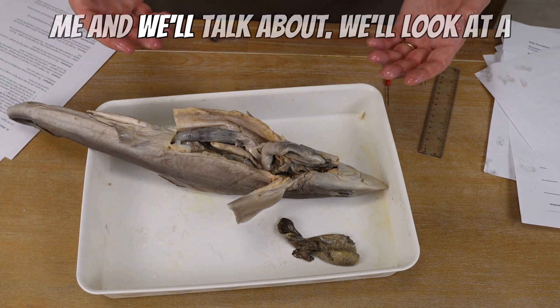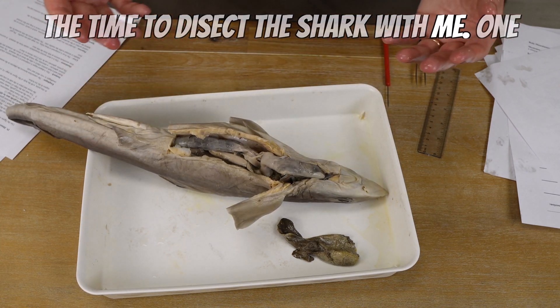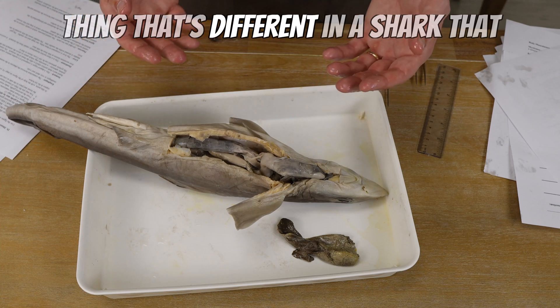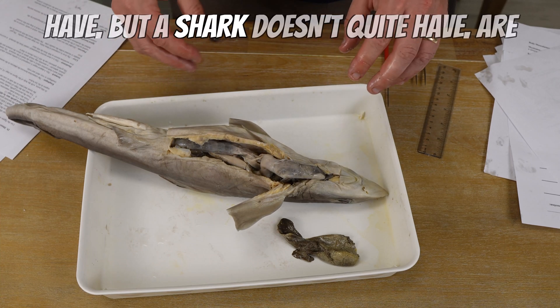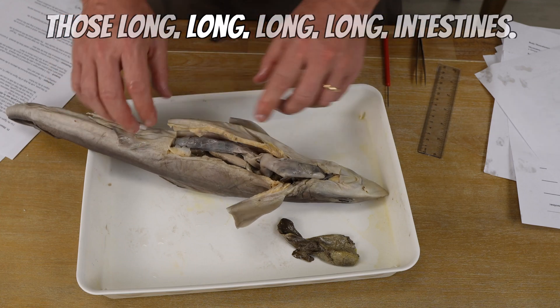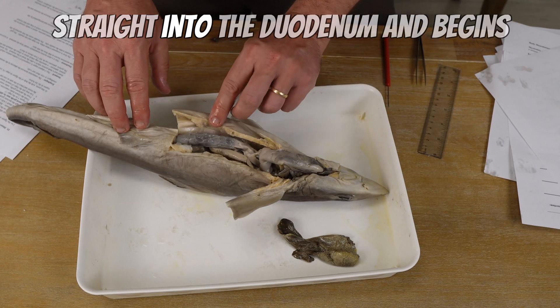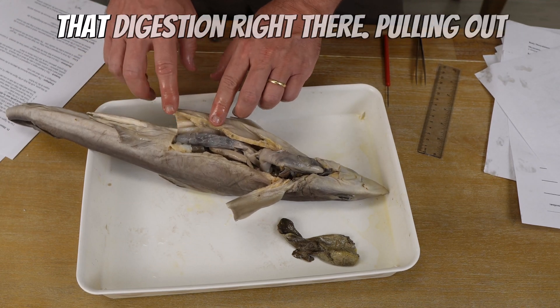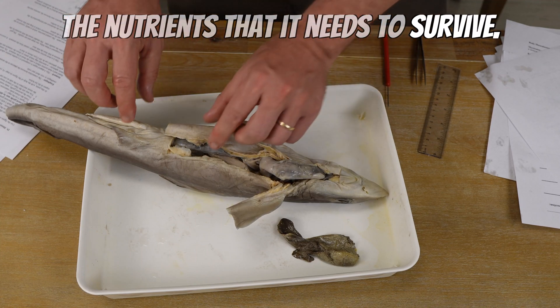One thing that's different between a shark and a human is that humans have long, long intestines, but a shark doesn't quite have that. Instead, the shark goes straight into the duodenum and begins digestion right there, pulling out the nutrients it needs to survive.